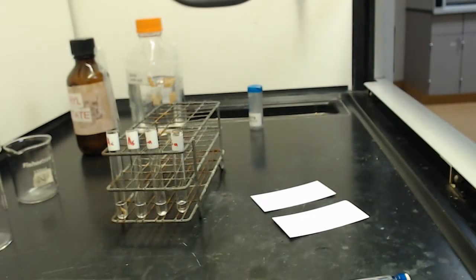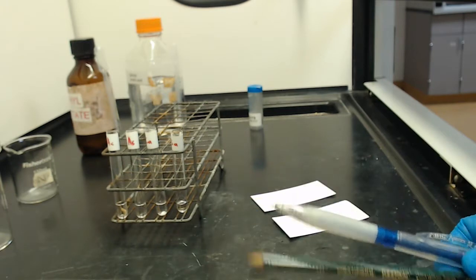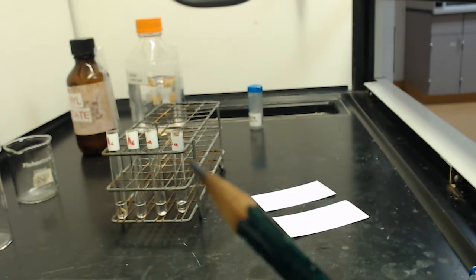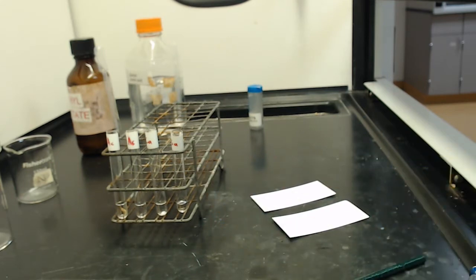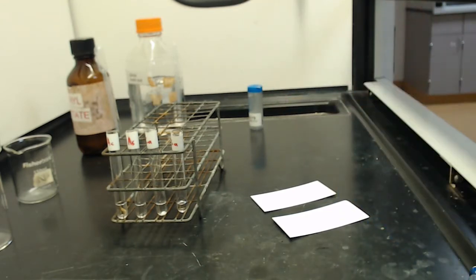Okay, for the next part here, I'm going to show you how to prepare your TLC plates for our samples. There are a couple of crucial details here that might be overlooked that you want to avoid. One of them is that when you're writing on the TLC plate, you need to use a pencil, specifically an old-fashioned, non-mechanical pencil. Two things here. One, we can't use ink, because remember, ink is an organic liquid. We have organic solvents, so your ink will actually go in solution. It turns out that graphite does not dissolve very well in organic solvents.